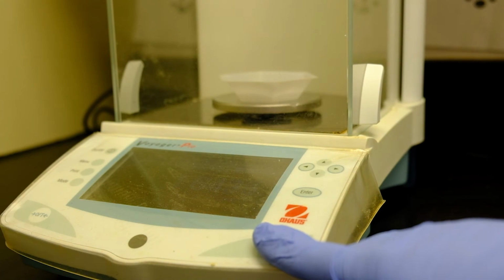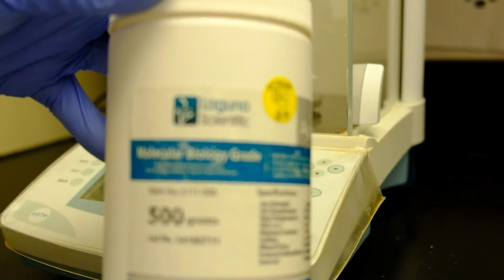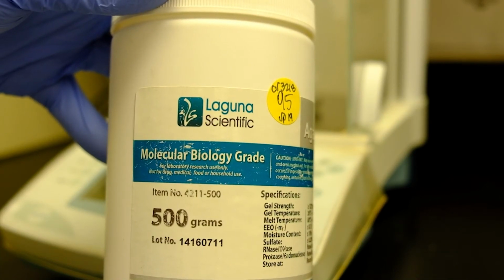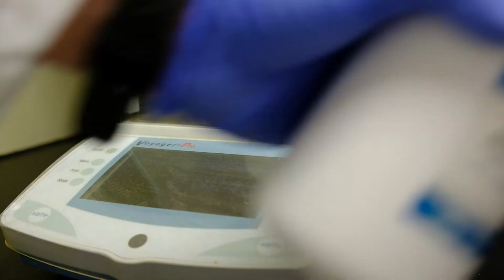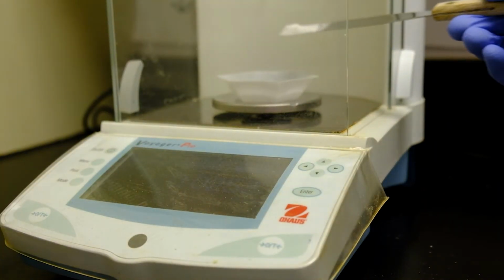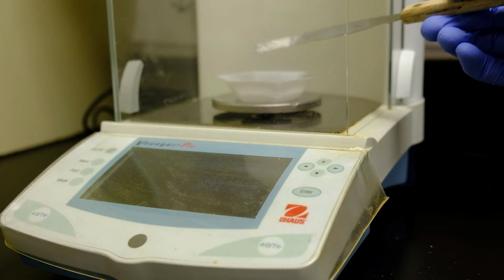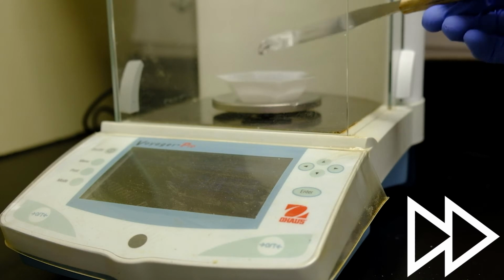Don't forget to zero your balance with the weighing dish on it. To prepare your gel, use only molecular biology grade agarose. For most applications, your gel needs to be about 1% concentrated. That is 1 gram of agarose per 100 milliliters of TAE buffer. Our gel will be about 70 milliliters in volume.